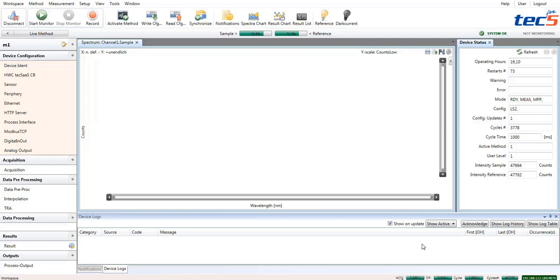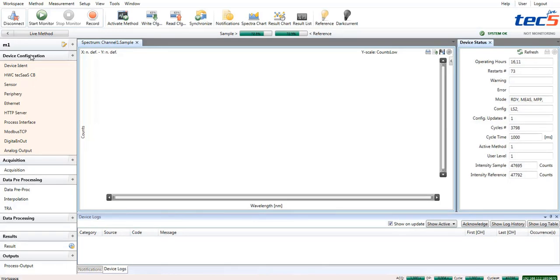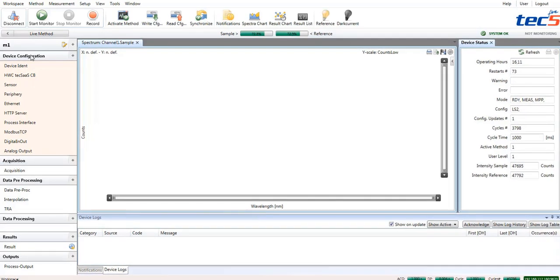Now, the first method steps show the configuration settings of your system. This is the hardware information which is usually preset on the system and normally does not have to be changed at all.